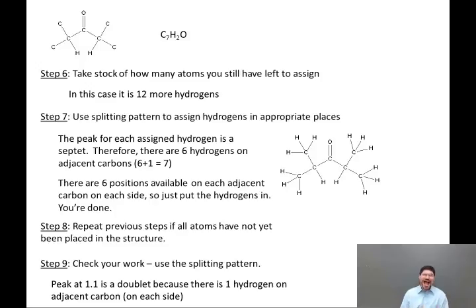Okay, so that's how to attack a typical NMR problem. And in the next lesson, I'm going to go over a few cases of molecules that contain aromatic rings and some patterns and rules that you need to be aware of.